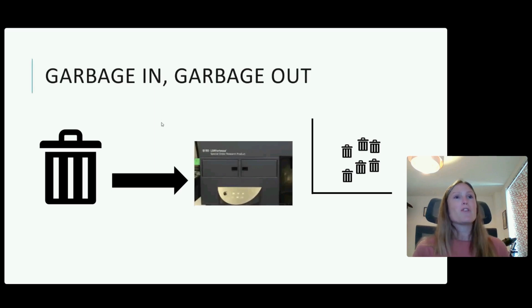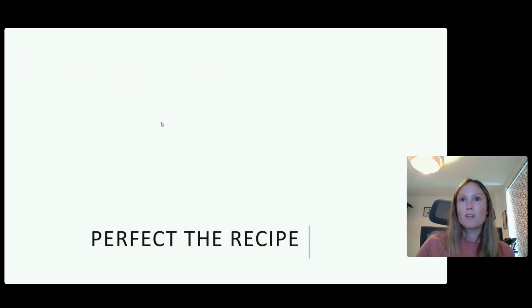And it's true, right? If you have a sample with a lot of dead cells, a lot of debris, a lot of clumping, if you've got a lot of background autofluorescence, you're going to have bad quality data. And by bad quality data, what we mean is we can't resolve stained from unstained. We've got high background and the populations aren't obvious. So you need to optimize each step of your protocol to generate high quality data.